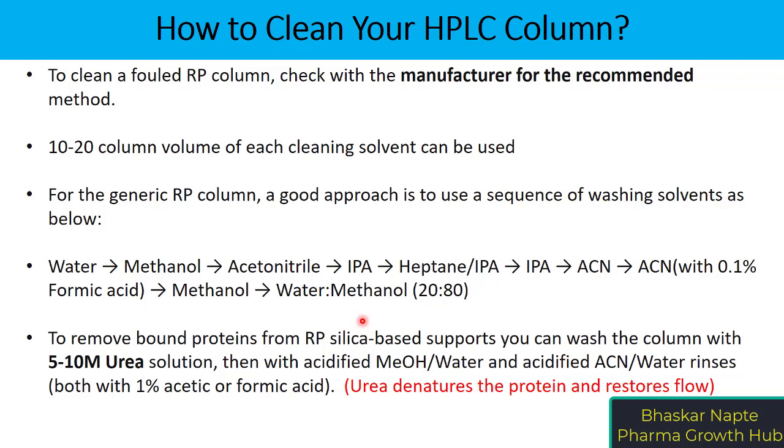In case you are using the column for protein analysis and the flow has become completely blocked due to prolonged column use, a urea solution of around 5 to 10 molar can help denature the proteins deposited onto the column and restore flow. Once you conduct washing with urea, you can follow up with acidified methanol-water or acetonitrile-water, using acetic acid or formic acid to acidify the mobile phase.